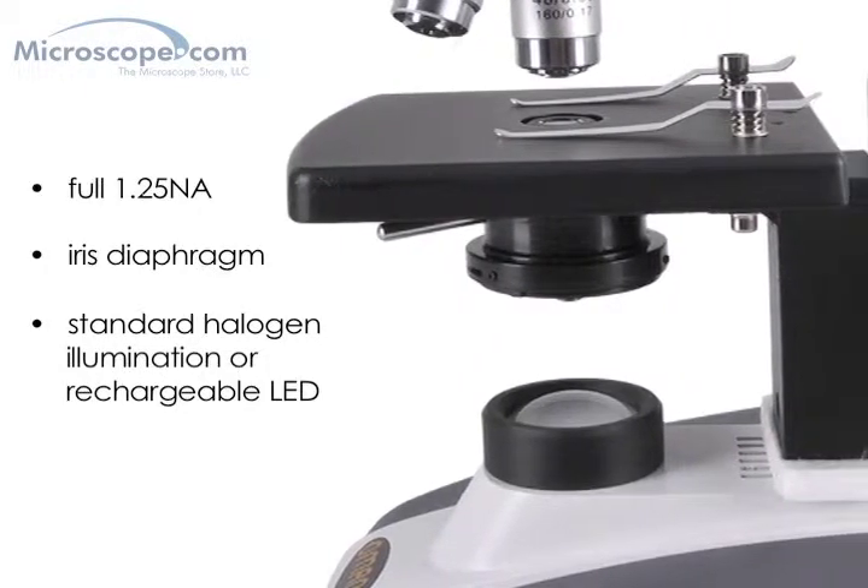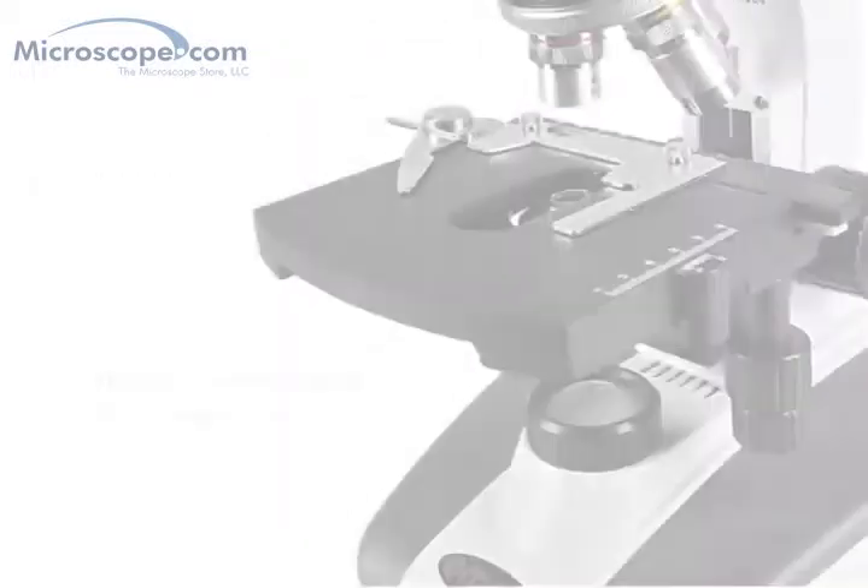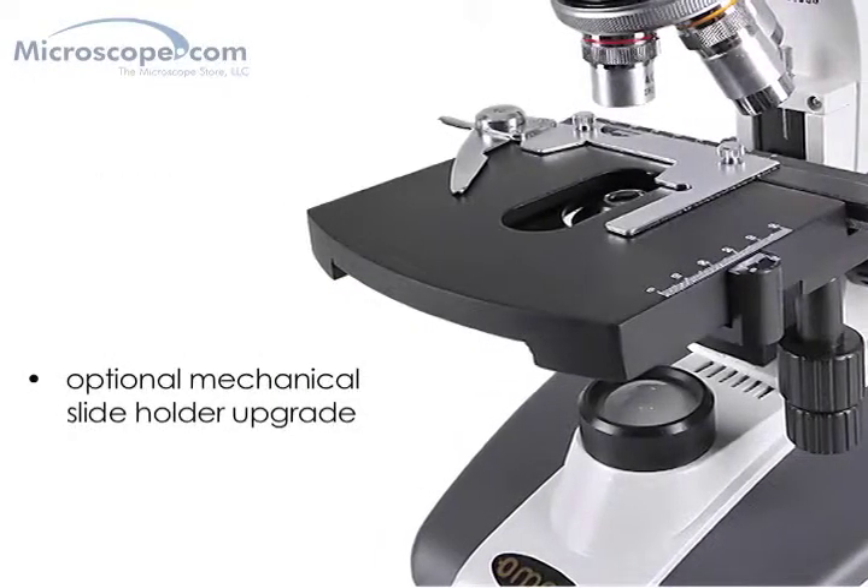The unit features a solid stage plate with metal slide retention clips, which is upgradeable with an optional mechanical slide holder.